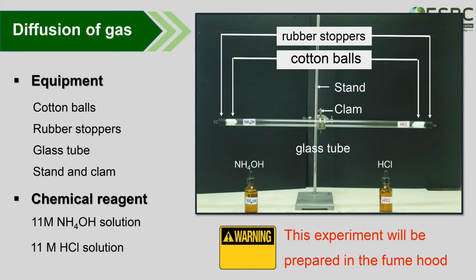These are the equipment and chemical reagents we used. This picture shows the setup of the gas diffusion experiment.